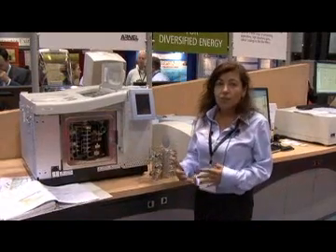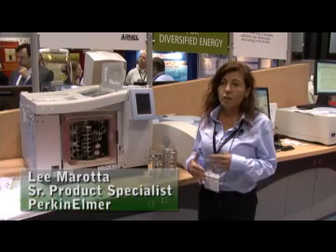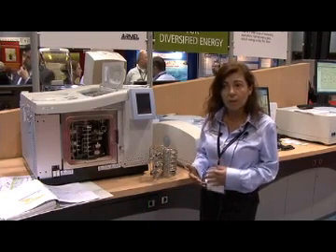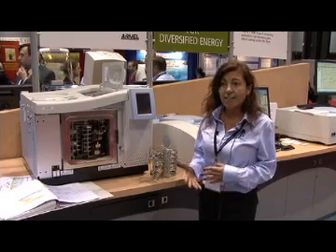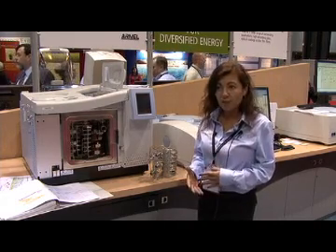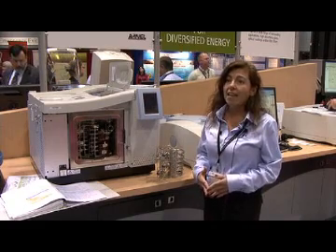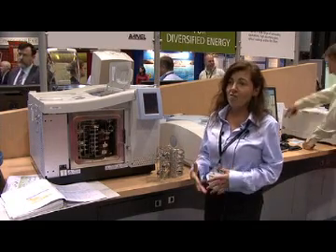One excellent feature about On-L products is their analyzers. They're specific for gas applications and also some liquid applications, and they're guaranteed analyzers — tested at our factory after they're manufactured. We test them with the columns that you're going to be using, and we provide all the documentation. They just run and run and run.